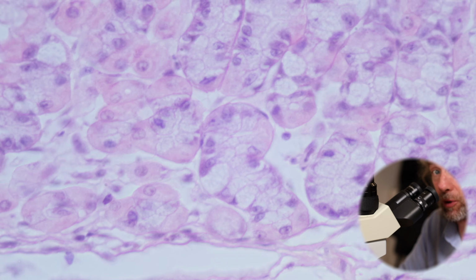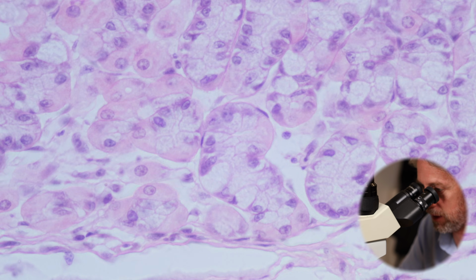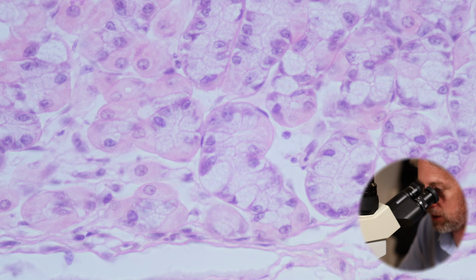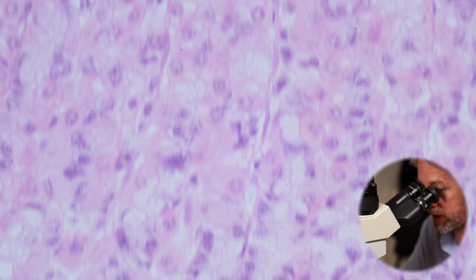So these are the ones producing a proteinase, producing an enzyme. That's why they look so different to the hydrochloric acid producing cells. So the chief cells look like the segments of an orange if you get the right section. They look like they're producing proteins, producing enzymes. I've been looking at slides too long, haven't I? They've got that certain look to them. Anyway, those are the gastric glands. Those are the two major cell types in there that we're most interested in.